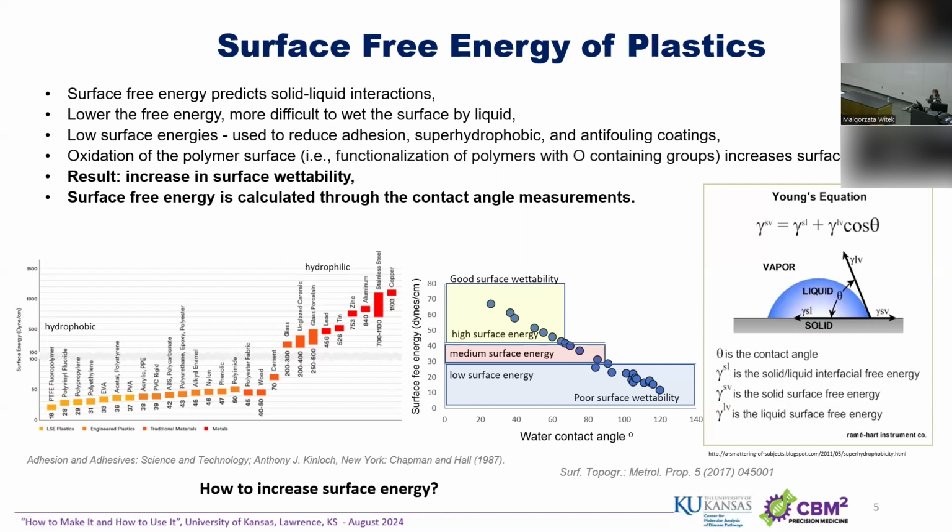How do I measure this in the lab in an easy way? There's a very simple way to do this, by measuring the water contact angle. By evaluating the shape of that water drop, you can tell whether the surface is indeed hydrophilic or hydrophobic. Think of an elephant plant, or any plant, when they get wet and the water drops, right? You have those perfect drops. Think of Teflon, super hydrophobic. You'll have a perfectly round drop if you deposit water on the surface.